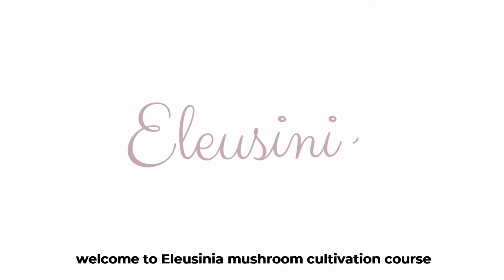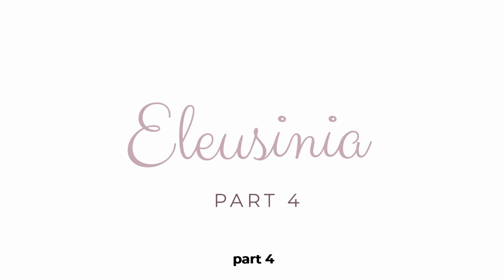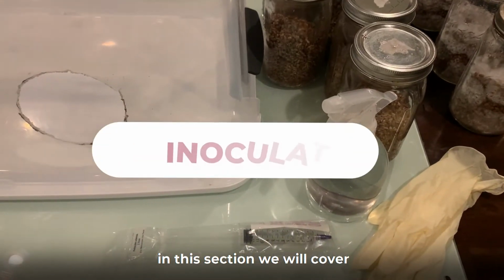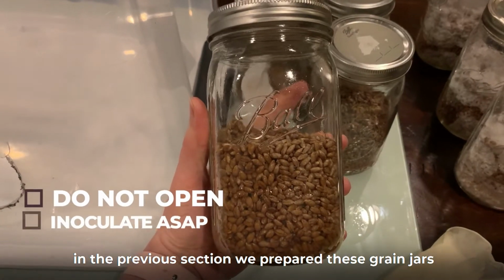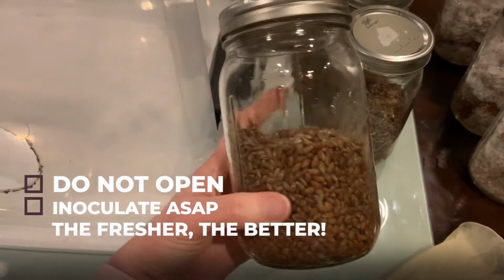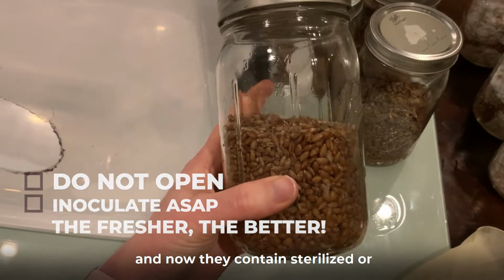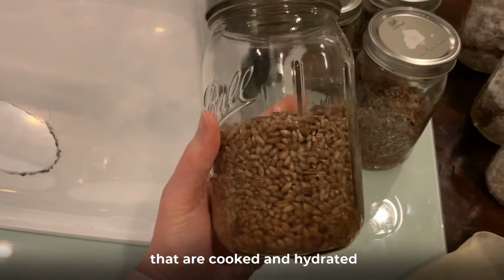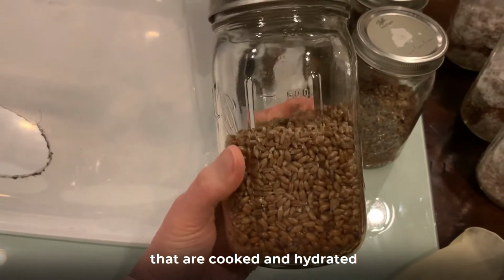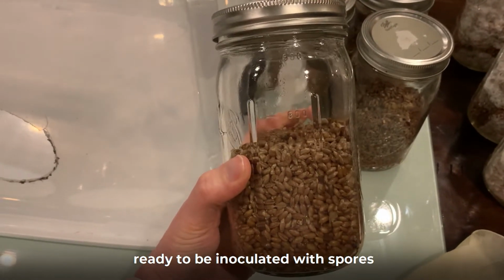Welcome to the Eleusinia Mushroom Cultivation course, part 4. In this section, we will cover inoculation. In the previous section, we prepared these grain jars, and now they contain sterilized or very close to sterilized grains that are cooked and hydrated and ready to be inoculated with spores.